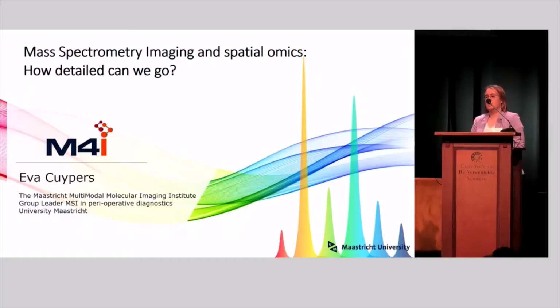So I'm Eva Cuypers. I work at the University of Maastricht, and there I'm the PI of the research group Mass Spectrometry Imaging in Perioperative Diagnostics. That includes, indeed, intraoperative diagnostics. I will not talk about that today, but also perioperative, meaning we're working towards digital pathology on the single cell level using mass spectrometry imaging, and this I will present to you today.